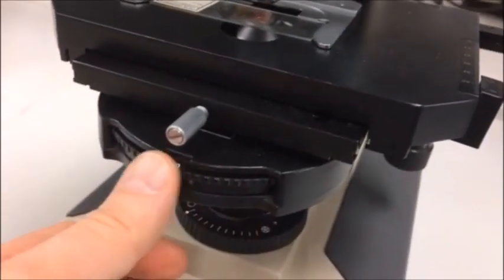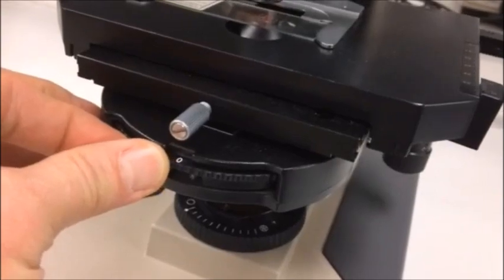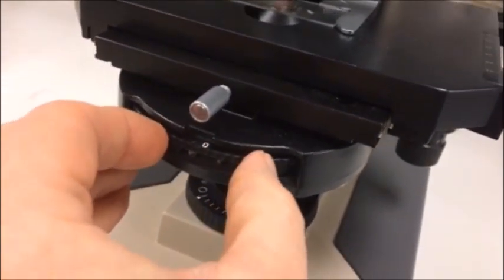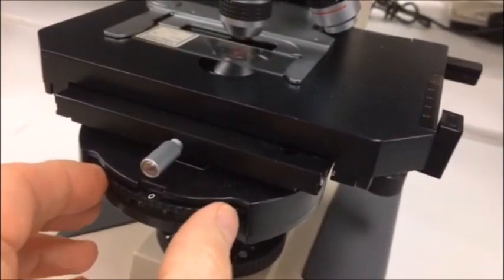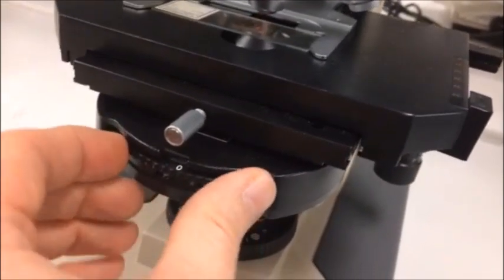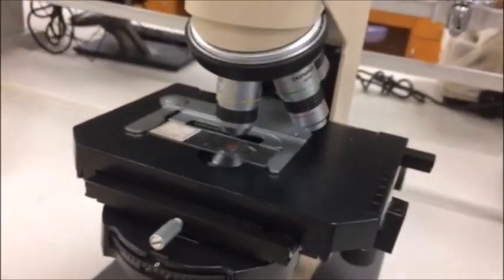There's also this adjustment down here, which is something that you use when you're doing a type of microscopy that we are not doing, which is called phase contrast. And so if you're not doing phase contrast, this needs to be clicked into position for zero. So basically, you just leave that where it is.